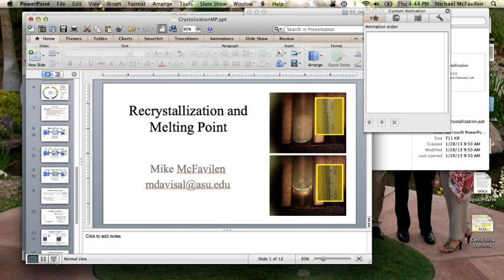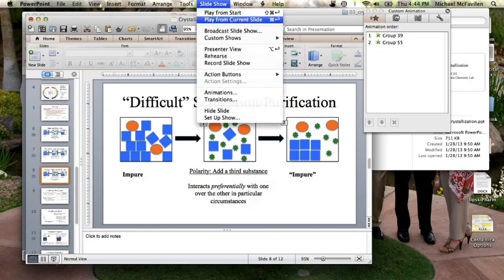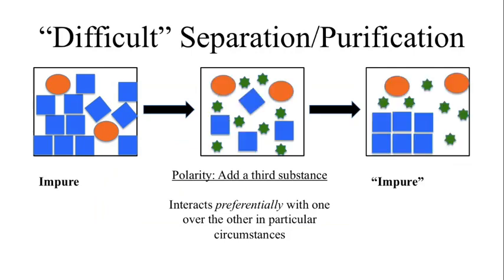I want to go back to this technique here real quickly for the recrystallization, because I did forget one important aspect. When we go through and try to dissolve the compound, and this is a good question for quizzes, hint, hint, hint, so pay attention to this. How much solvent do we add? And this is where it gets kind of tricky.